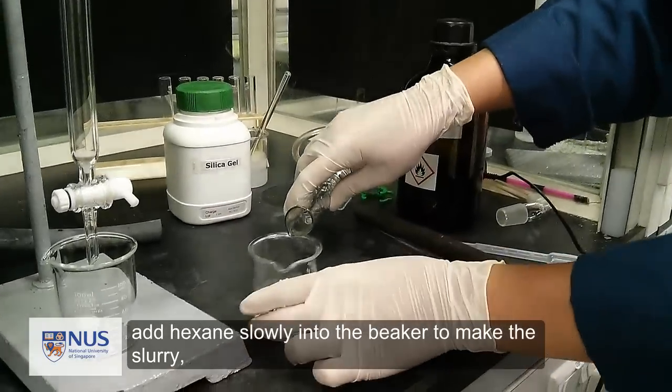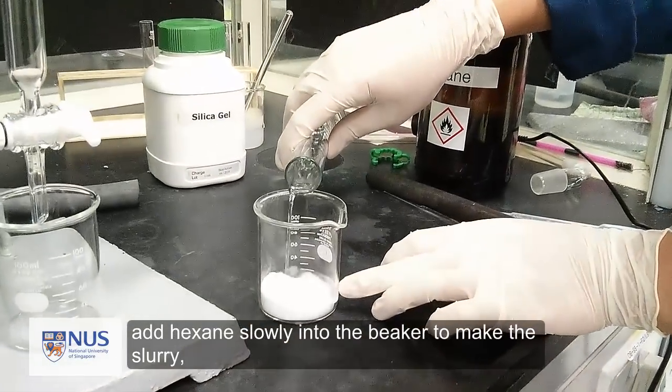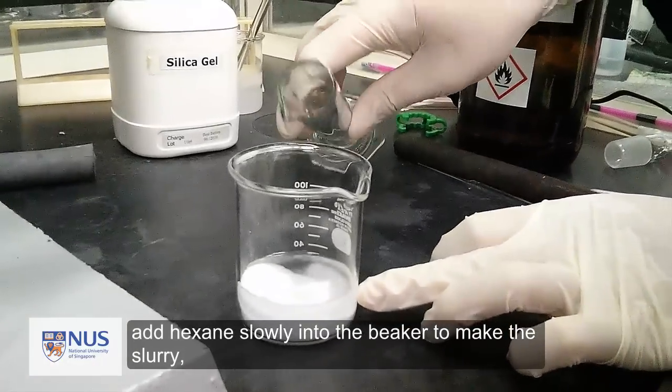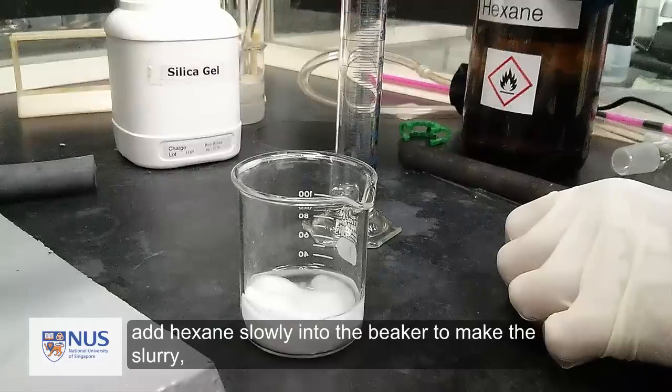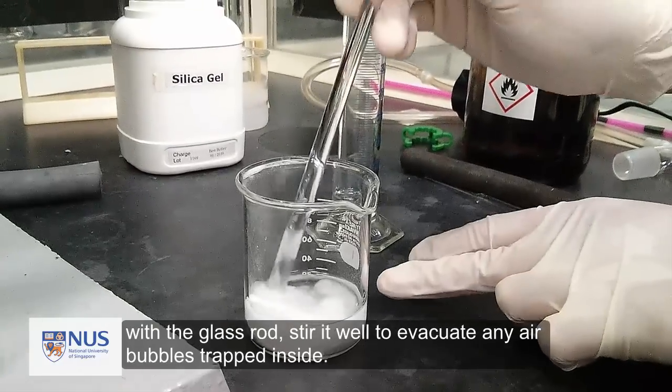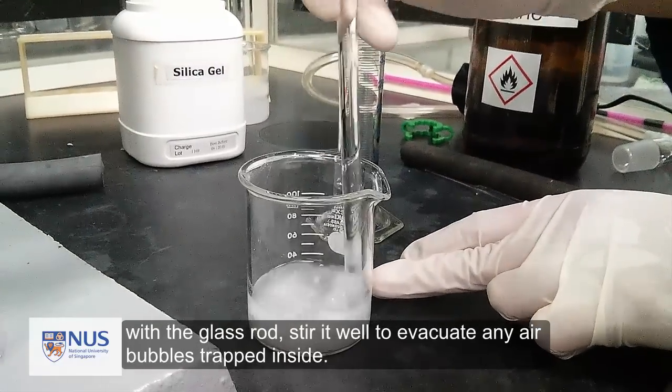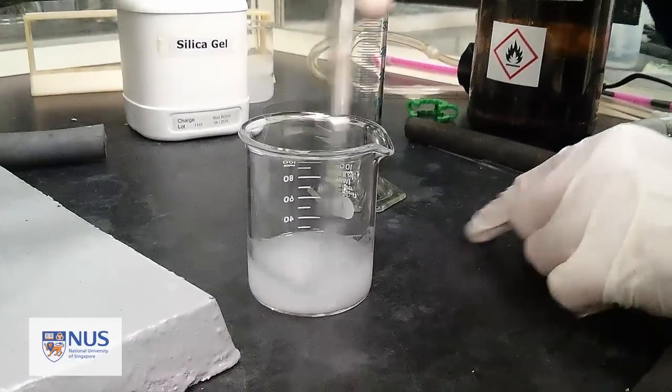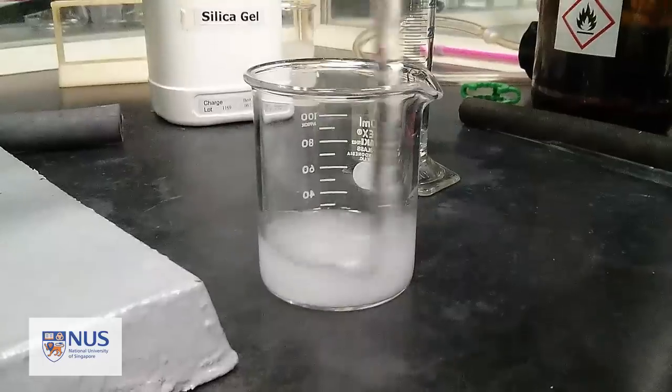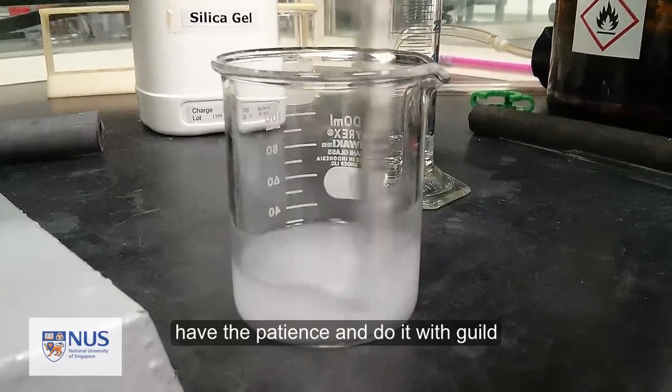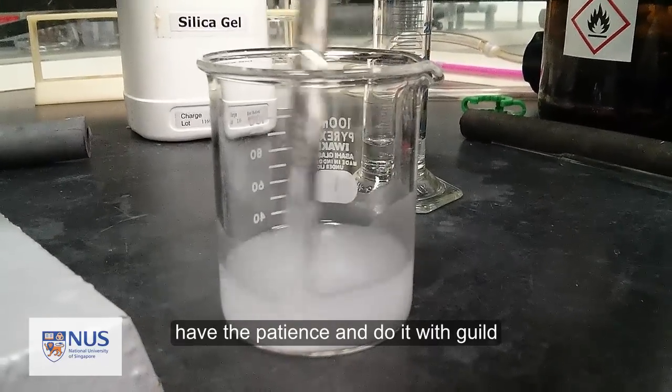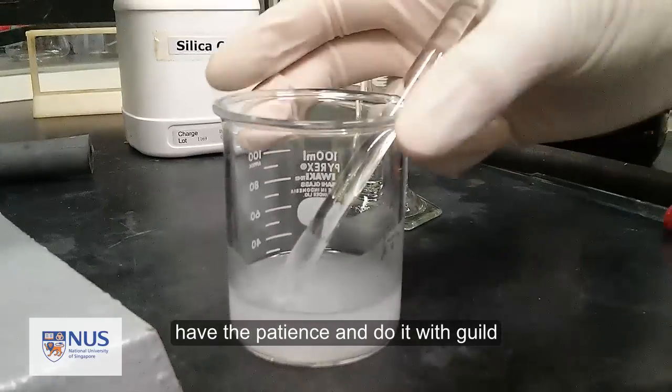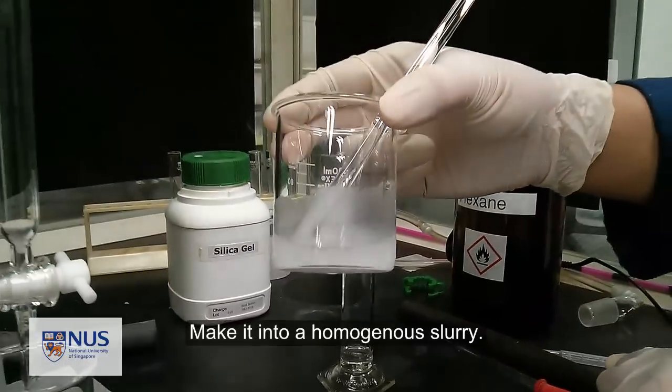Add hexane slowly into the beaker to make the slurry. With the glass rod, stir it well to evacuate any air bubbles trapped inside. Make it into a homogeneous slurry.